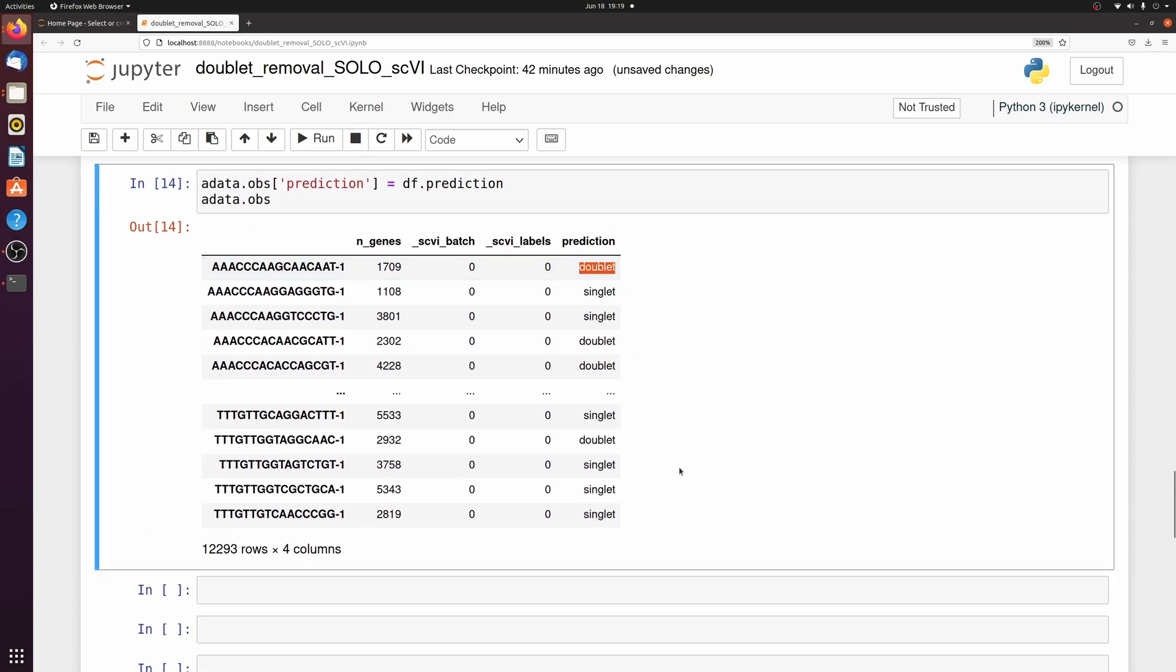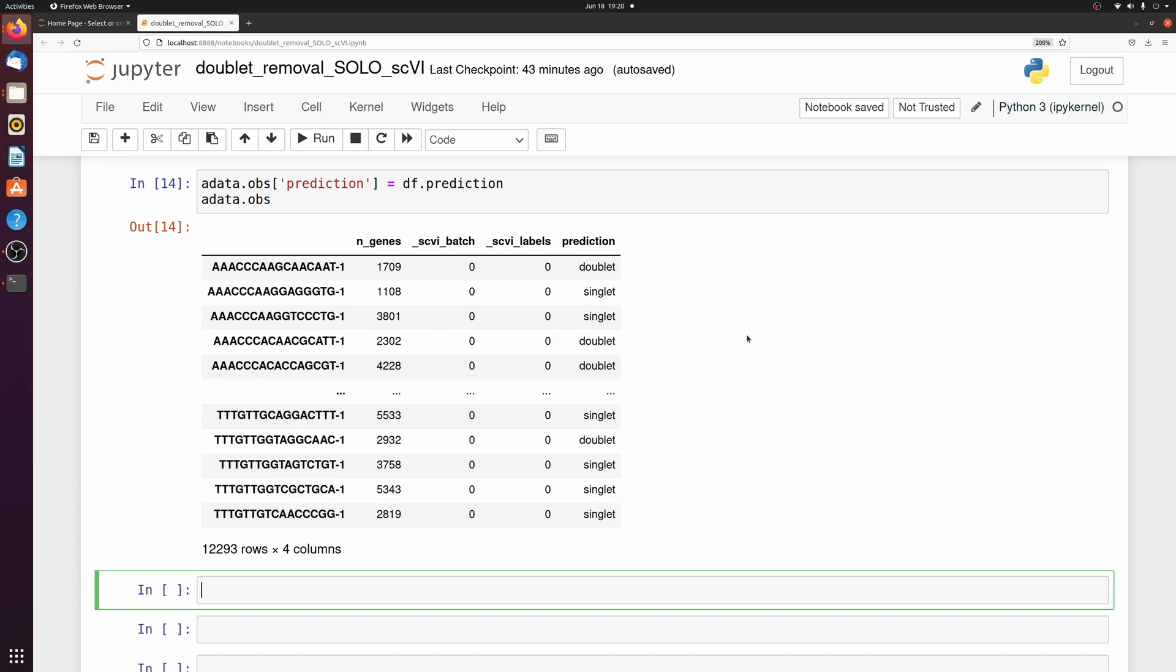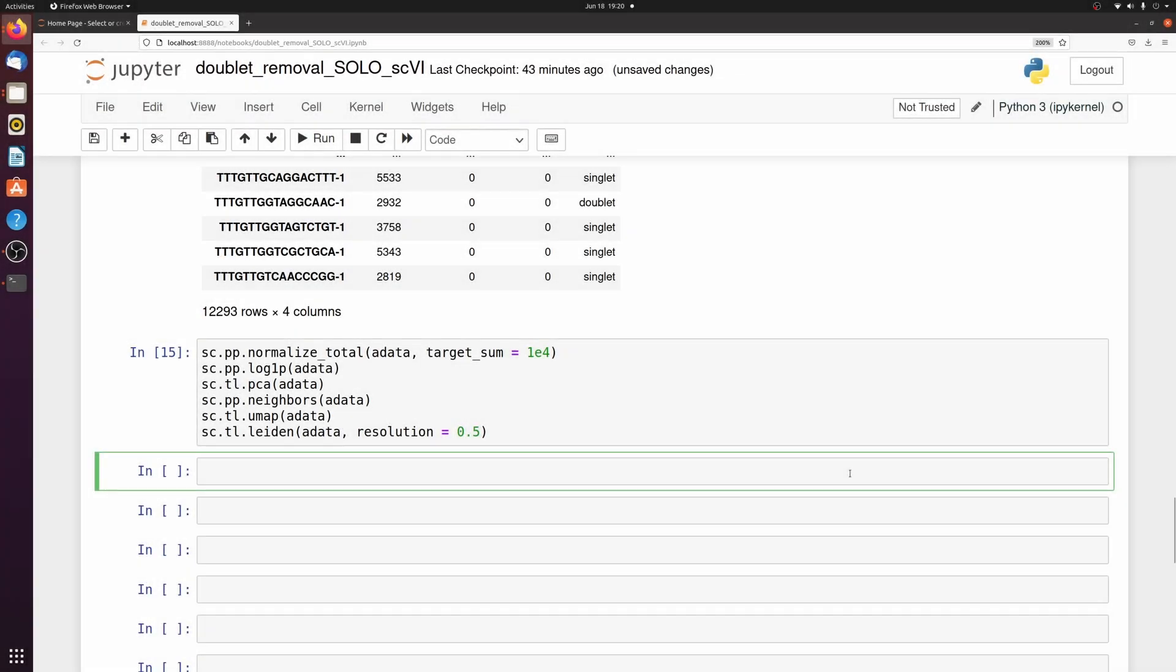So I'm just going to add that prediction onto the adata.obs. So I just added that. I'm just going to do typical scanpy clustering real fast and then let's visualize this on a UMAP.